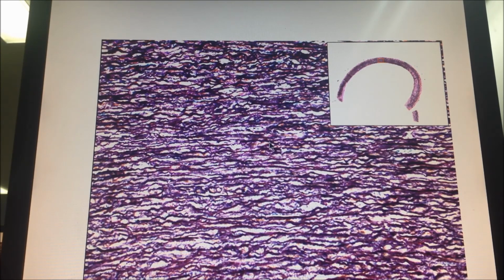The wall of the aorta is composed of elastic connective tissue. It makes sense. You need the wall of the blood vessel to be able to stretch and recoil. You need a large amount of elastic fibers. In the wall of the aorta, as you can see, there are 3 different colors. First, the black lines, the black folded lines, are the elastic fibers. Large amount. Between them you can see 2 colors. Some areas look reddish and pinkish, and some areas look closer to bluish or greenish.